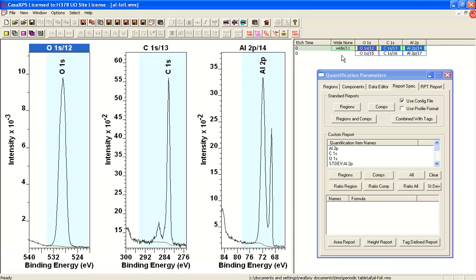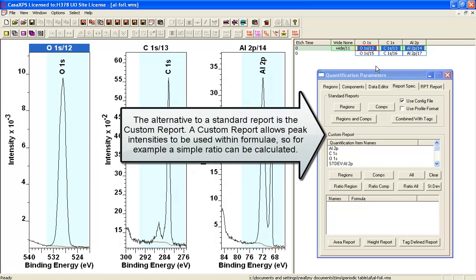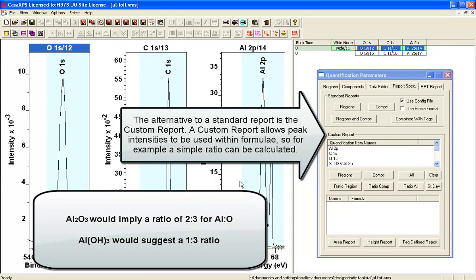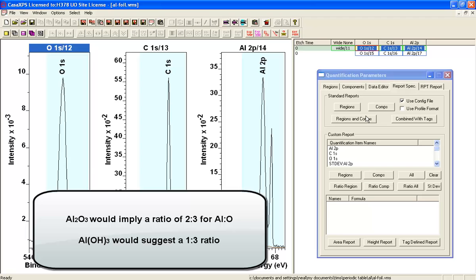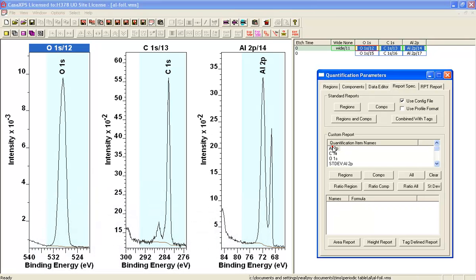So using these three regions we can produce a report. The first thing that we might want to do is see how this relates. If we've got an aluminum foil, the first thing we would like to see is that the aluminum and the oxygen are in a given proportion. So let's go to the report spec and look at what the ratio is of oxygen to aluminum.